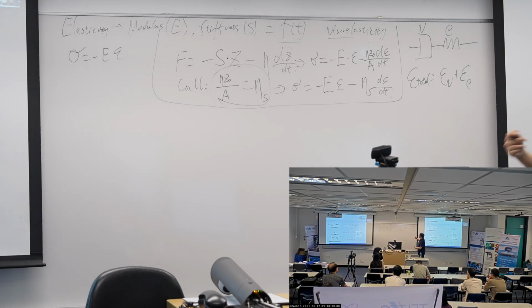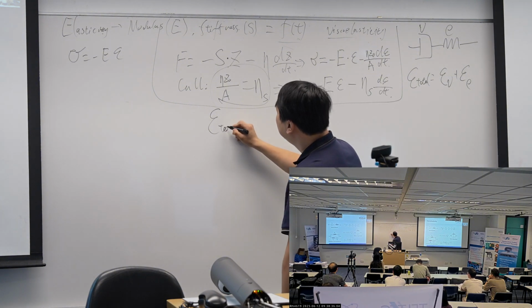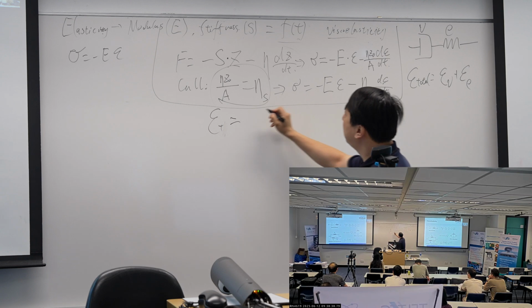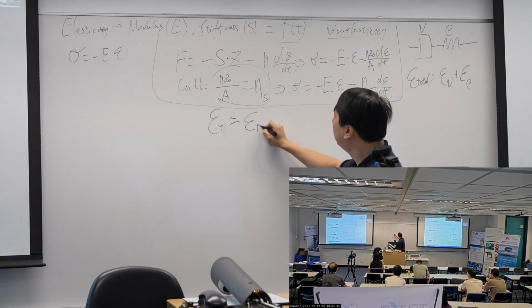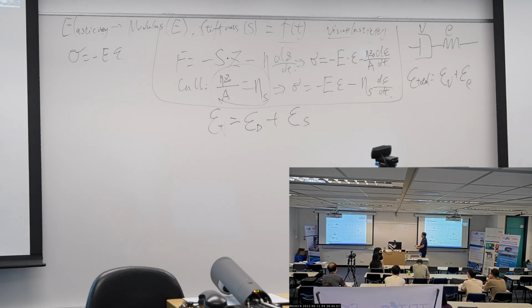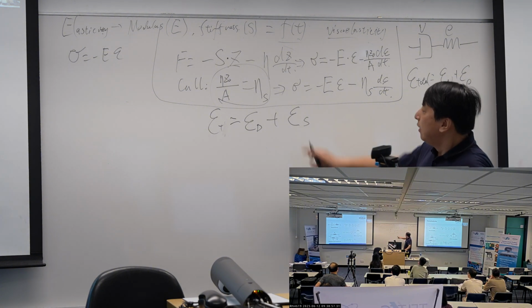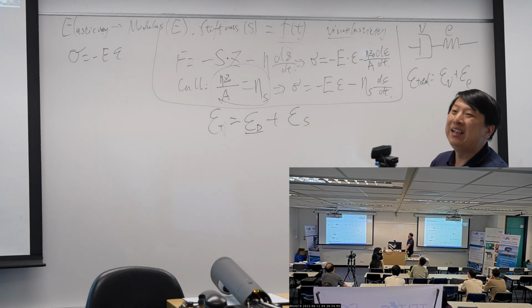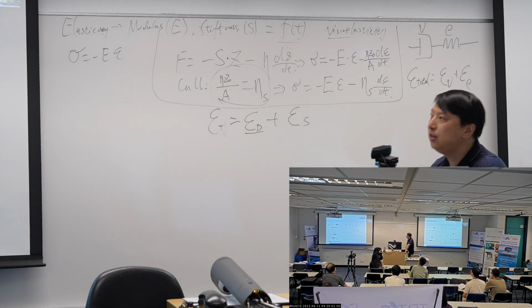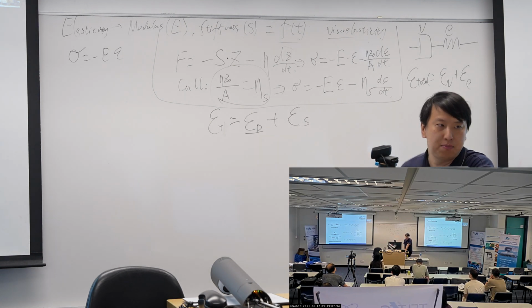Okay, so the equation is easy. The total is the damper part plus the spring part. So he tried to link it to Hooke's law or Newton's law. For the damper, it is hard to measure deformation, because in Newton's fluid law there is no deformation but a rate.